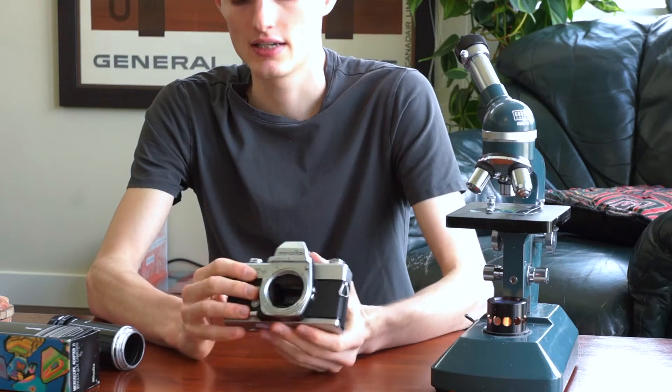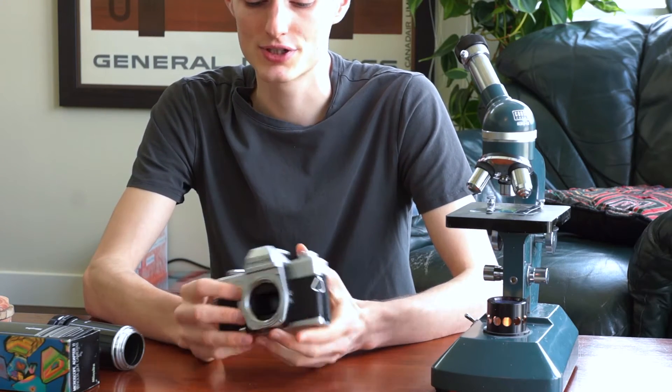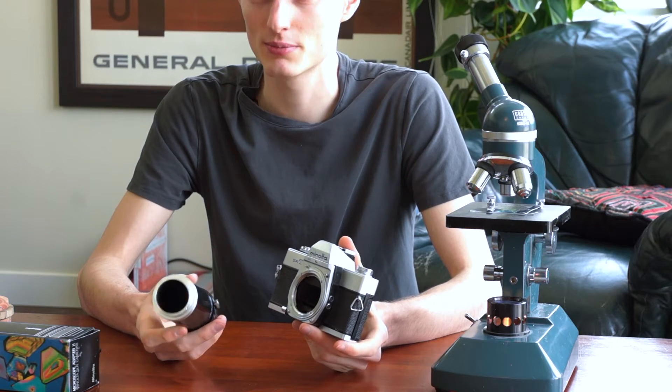The camera I'll be using to demonstrate is this Minolta SR-T101, which just has an SR mount, but any Minolta SR mount camera will work. The actual adapter itself is just a metal tube — there's no coupling to the microscope really and there's no electronics in the adapter, so any simple camera will work. You can also use a modern camera, provided you have the correct Minolta mount adapter for your camera system.